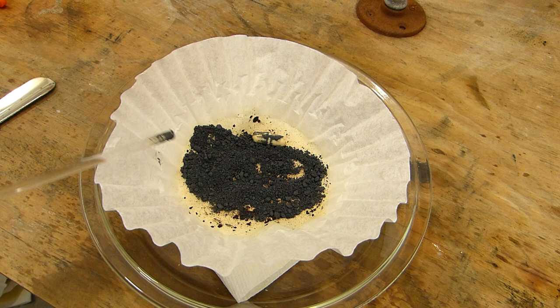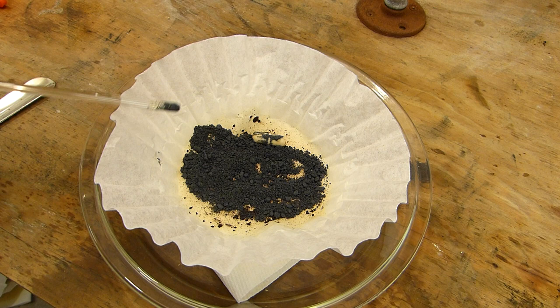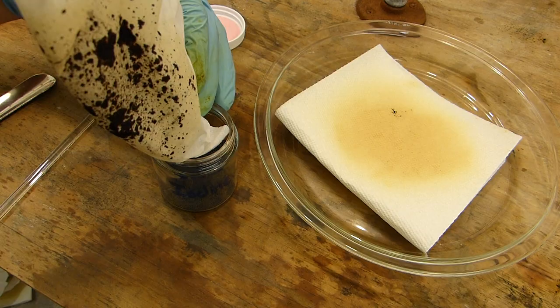And it's preferable to keep this in the refrigerator because the iodine will eventually sublime. And of course you can see under there it's turned the cap purple. And it will escape the container quite handedly if left to its own devices. So keep this vapor pressure as low as possible. Keep it in the refrigerator.